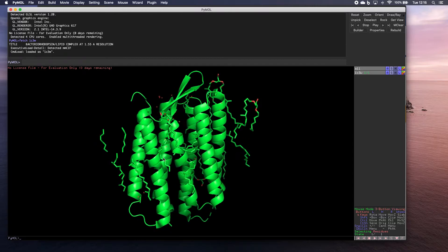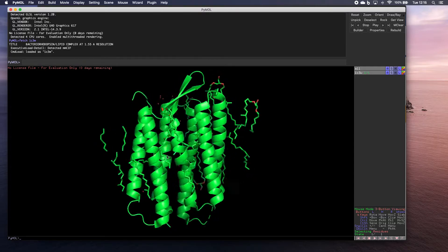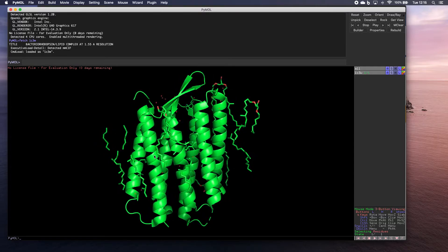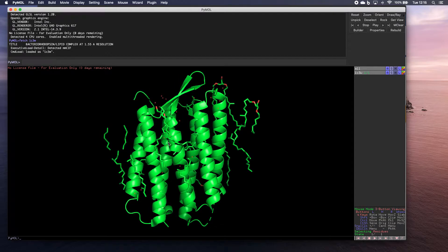And it's all a bit green. It's all a bit dull at the minute. So we want to spend a bit of time making this look a bit prettier.